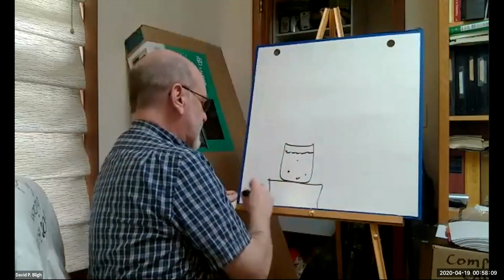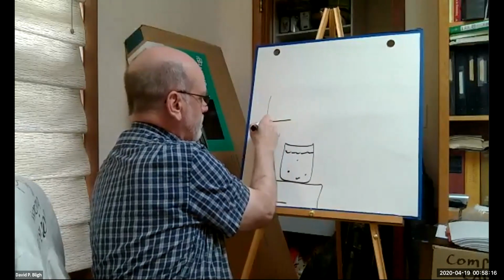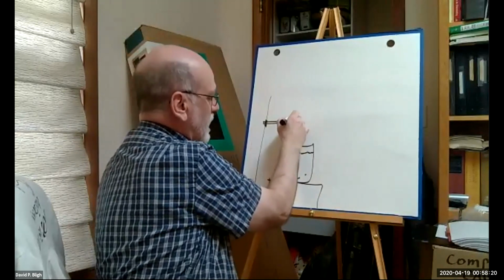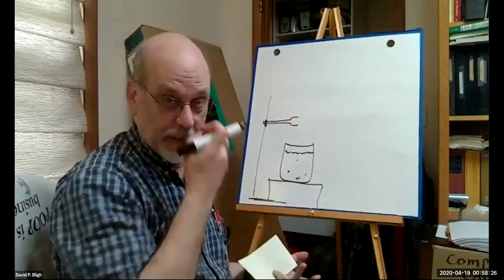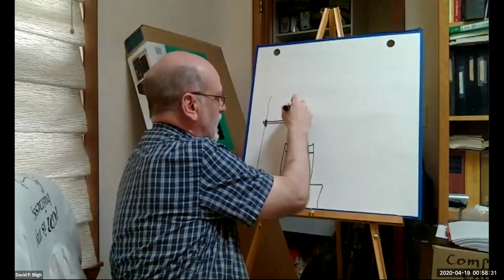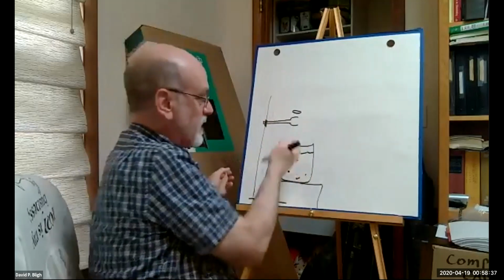And then you need a ring stand. So you need a ring stand, and you need an adjustable clamp to hold your test tube. And you're going to have a large test tube. So we have our test tube. We're going to grip it toward the top so we can submerge as much as possible in the bath.